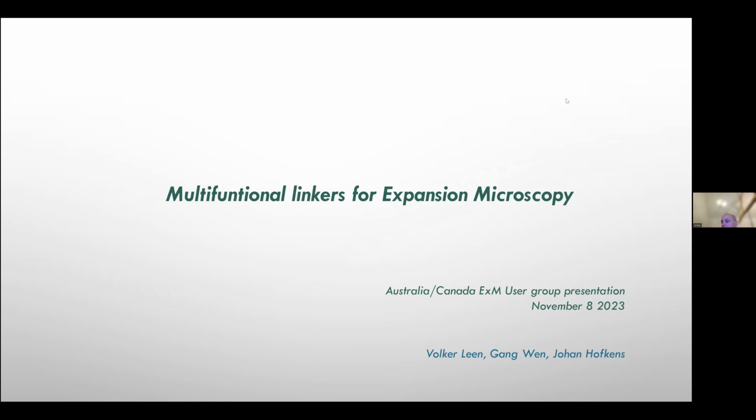Unlike my colleague Maarten, who immediately embraced the idea of physically expanding your sample as a way to realize super resolution microscopy. Now, my reluctance came from the fact that I'd been working before with polymers. There's typically a lot of heterogeneity involved whenever you work with polymers. So I was very skeptical that this isotropic expansion that they claimed would be something real or not.